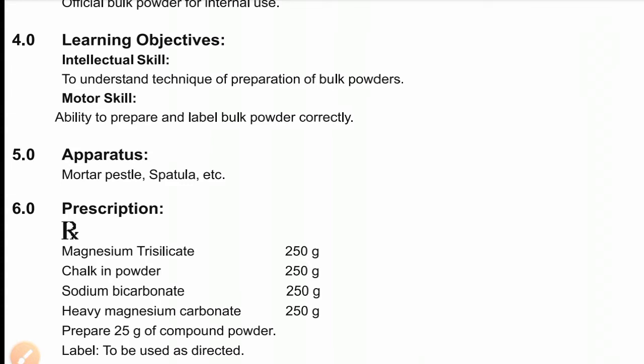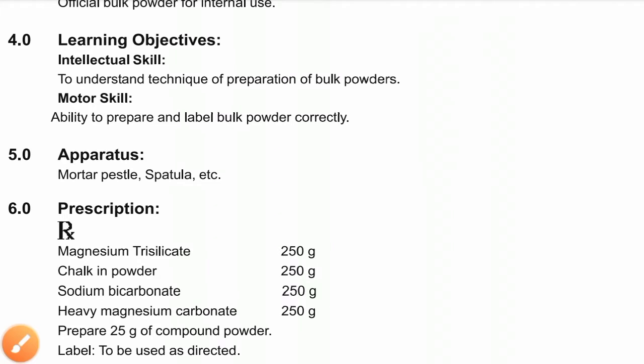Magnesium trisilicate is used to relieve indigestion. Chalk in powder acts as an antacid. Sodium bicarbonate is also an antacid. Heavy magnesium carbonate can act as both an antacid and a laxative.